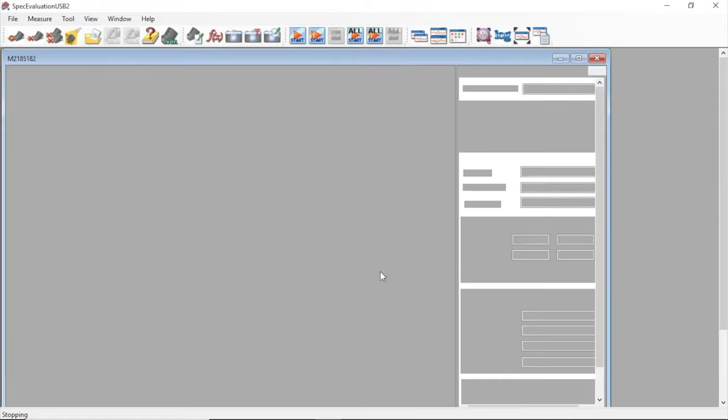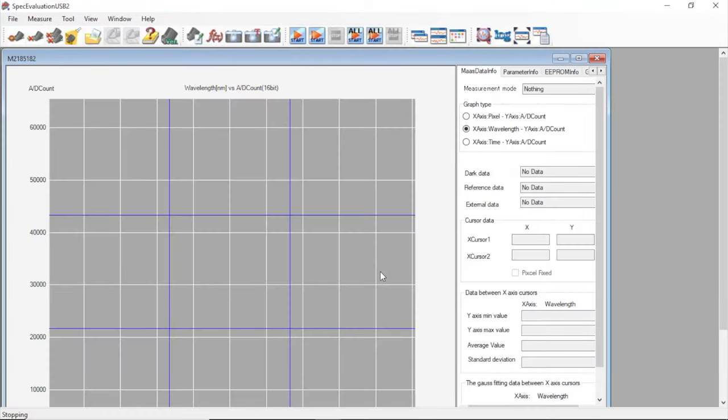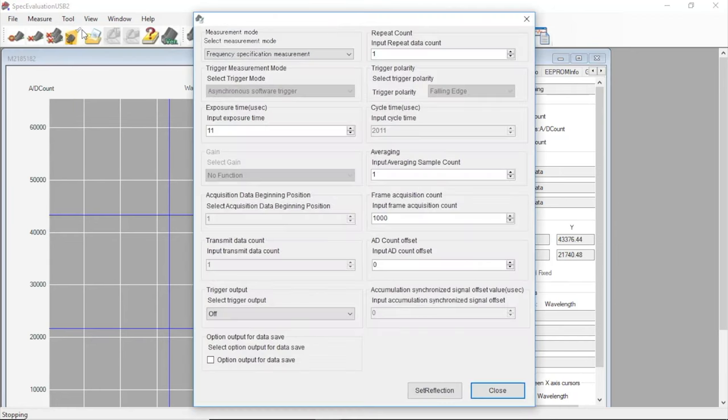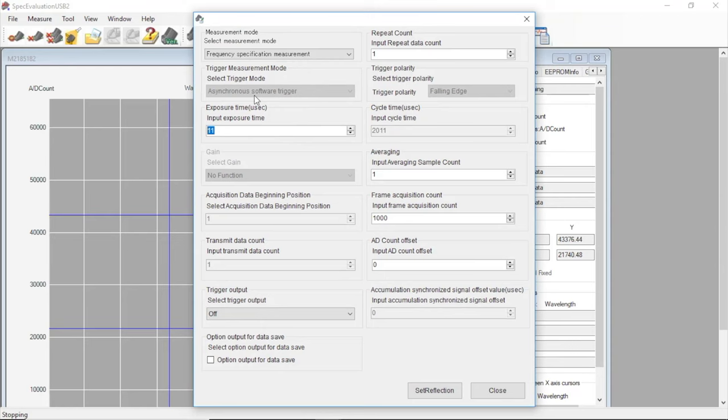Now, with the spectrometer open, let's monitor the output to get an initial reading of what it's seeing. We'll set some parameters for this monitored measurement by going to Tool, Set Parameter, and then opening it up to find a couple of options we can toggle with. For now, we'll be setting the integration time to the minimum value. This can be found on the spectrometer data sheet.